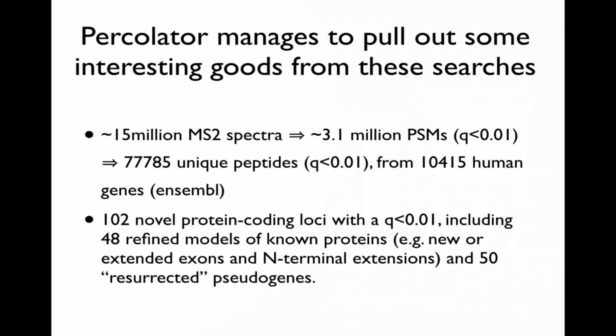It should be noted, though, that this was made from a cell line. So there could be questions here about exactly how human those different genes really are.